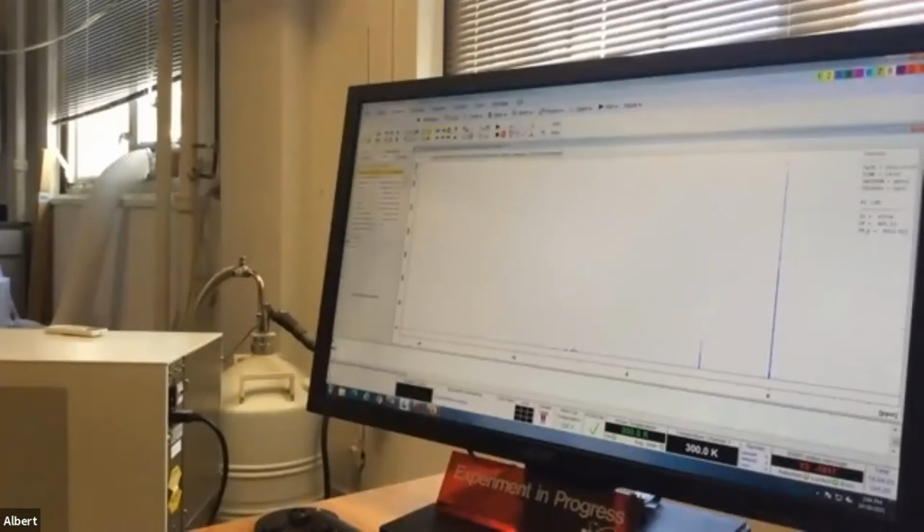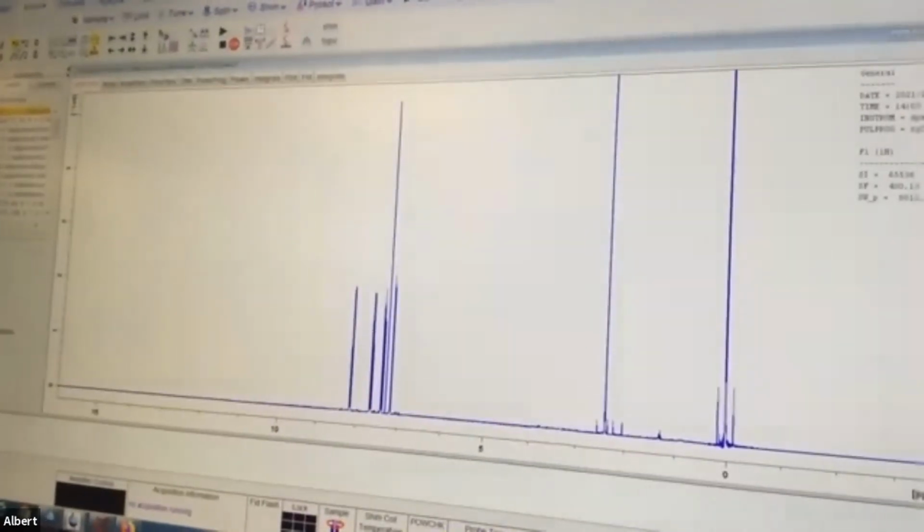All right. So this is what the spectrum looks like. So now click that 8, multiply, aspirin. Okay, click it again. Okay, great. Click 2, divide by 2.